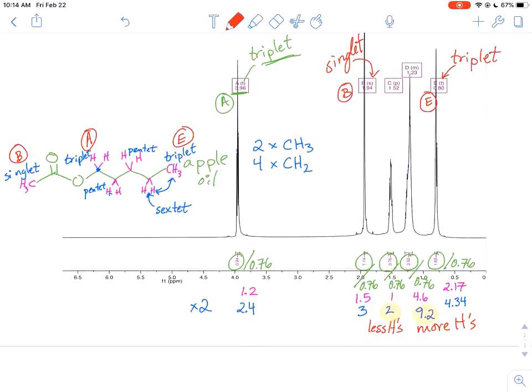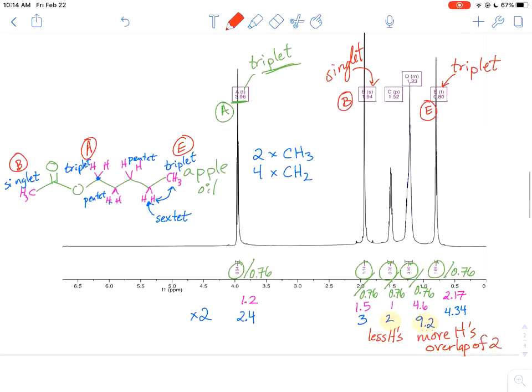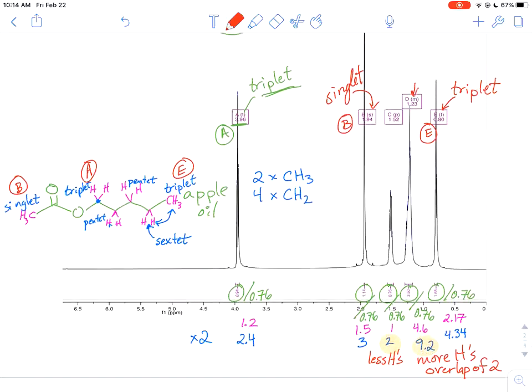And so all I want you to take from this is that this signal accounts for more hydrogens and this one accounts for less hydrogens. And what it's going to be is an overlap of signals. So this is going to be an overlap of two different signals that show up at coincidentally the same place. And another hint for that is that we have an M here that stands for a multiplet, which means it's an overlap of two signals. Whereas this guy shows up as a pentet. Now I don't want to take all the fun away from all of you.